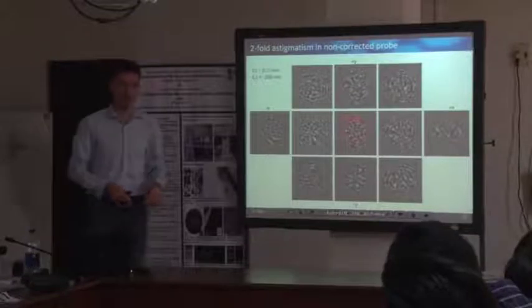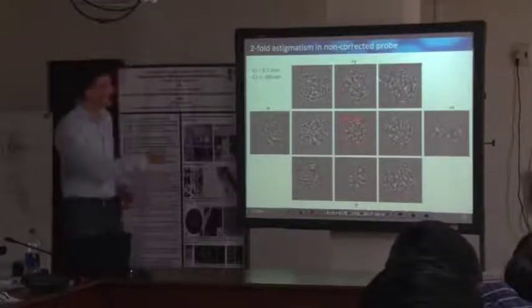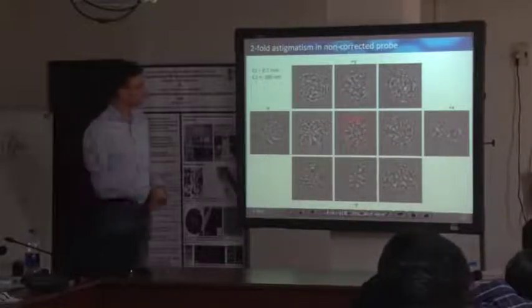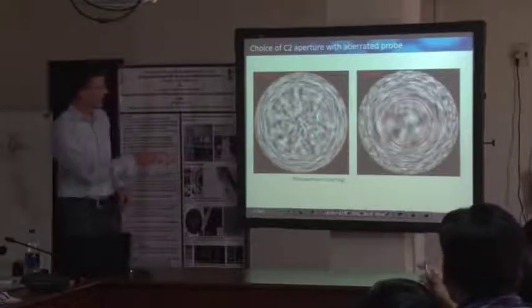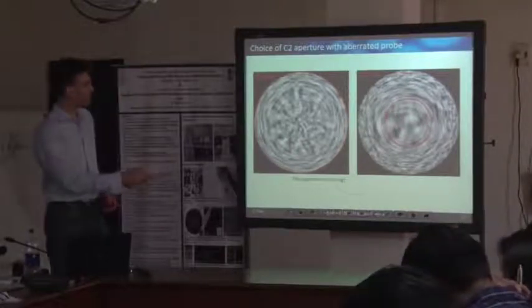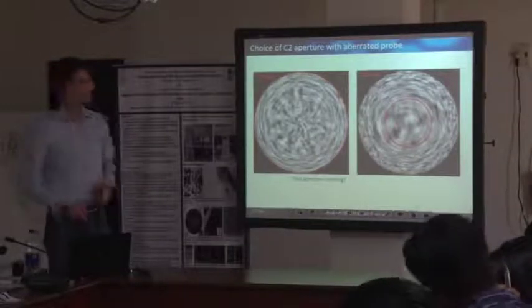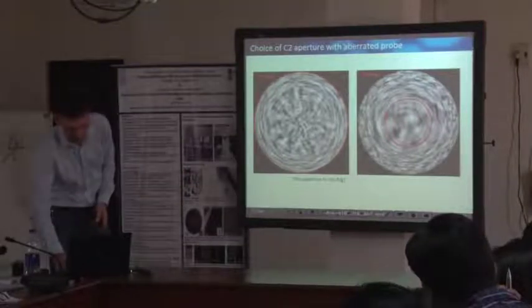So it's only the condenser stigmator to make the beam round on your sample. And you can nicely see that, and this is what we did as well yesterday. And yeah, so after aligning the astigmatism, you get to focus your electron probe, and finally you just insert a suitable condenser aperture and just cut off the tail.